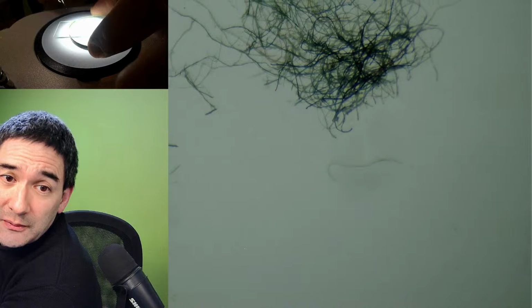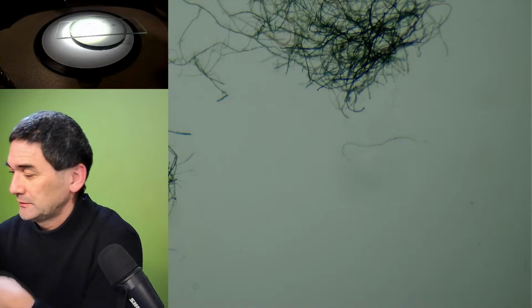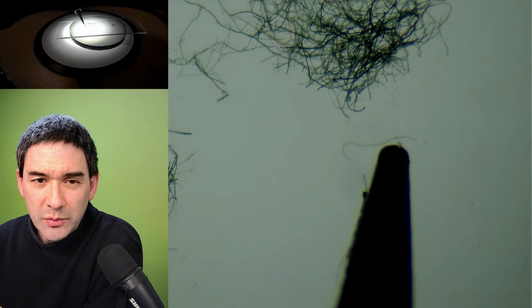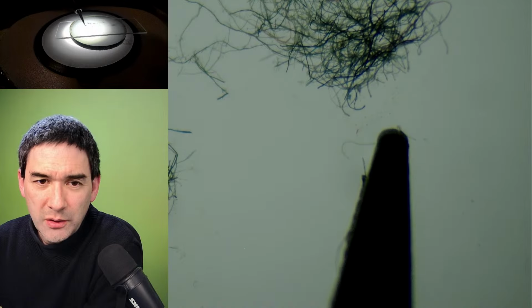Let me try something over here. They're still very much together. See this one over here. This seems to be on the other side of the slide.